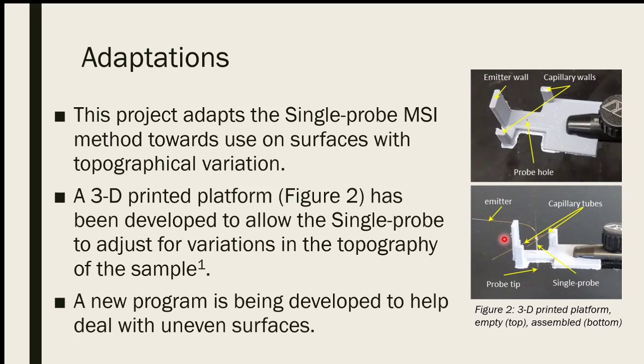So what are the applications for this? Let's say 10 years from now, if everything continues to progress, what's the vision for how this would be used? In the past, I know some mass spec imaging has been used on surfaces such as biofilms, though I don't know how useful that would be with this, just because I don't know how much variation there is in the surface.